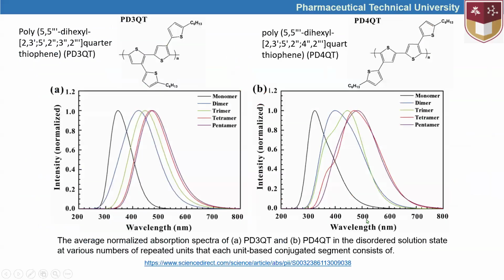Next. These two compounds differ from each other based on the number of carbons that this functional group was linked to, and had this kind of UV spectrum. The monomer of this compound had this kind of UV spectrum with the peak around, let's say, 340, 345.